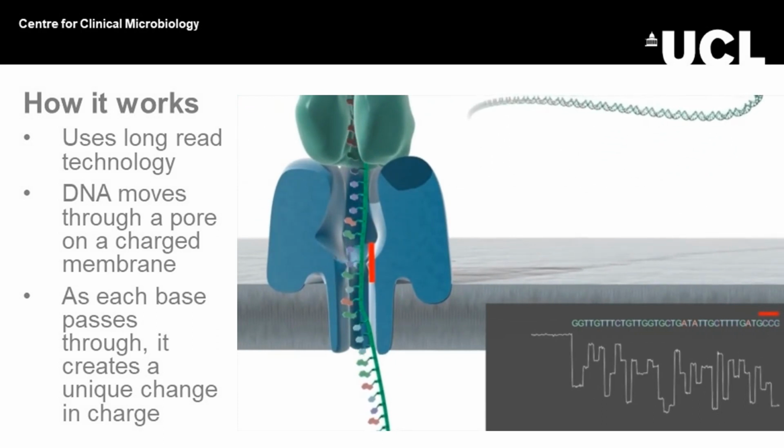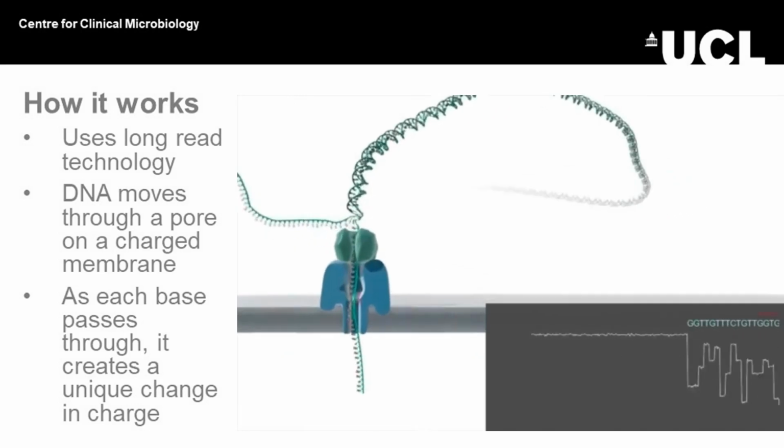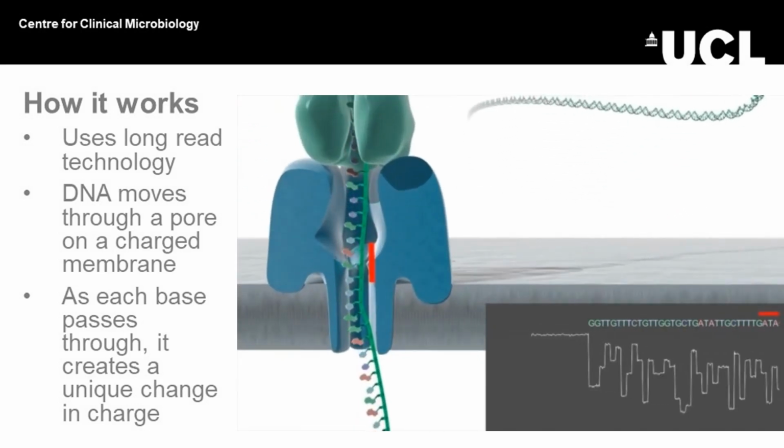But my screen's up. Screen's going the wrong way. There we go. So as I say, Nanopore uses long read technology.